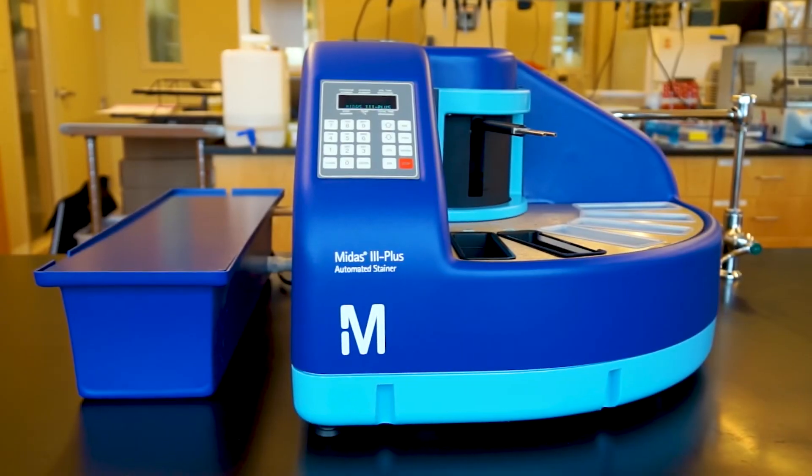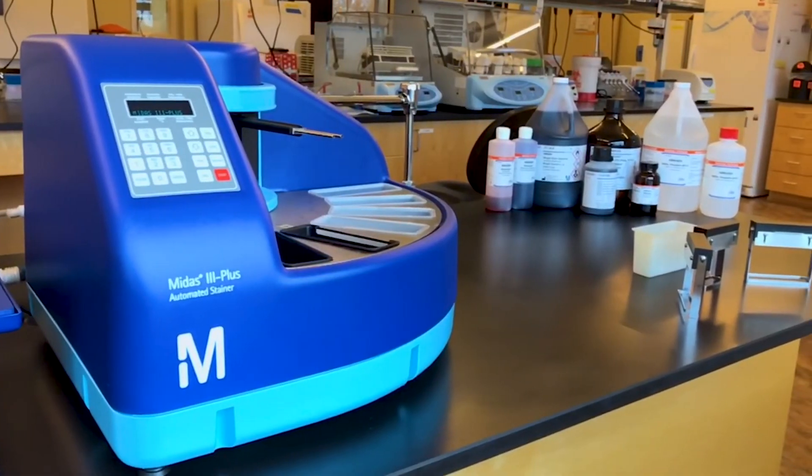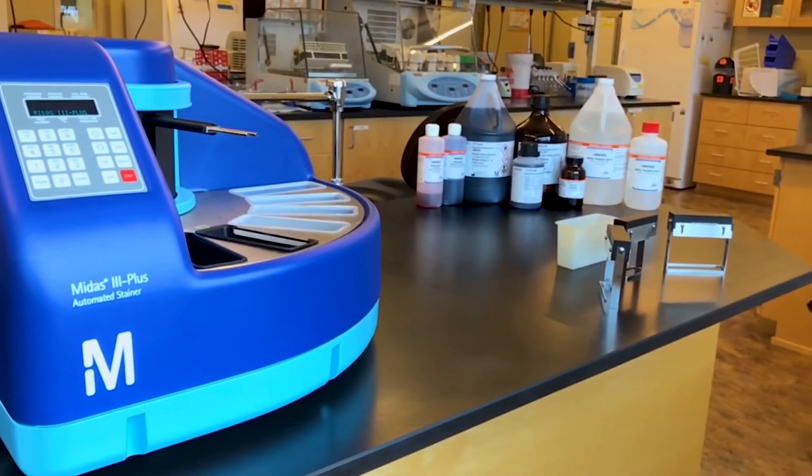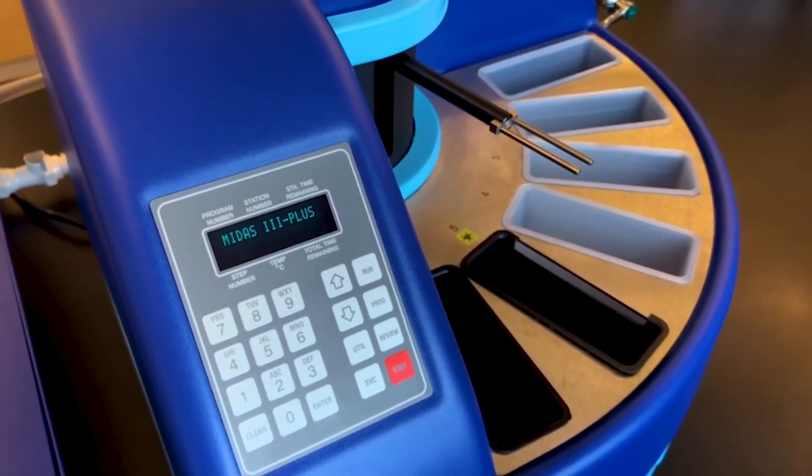The Midas 3 Plus automated stainer is compactly designed and has a small footprint. It will become the cornerstone of your laboratory. It requires only a power outlet and water supply to be fully operational in a matter of minutes.